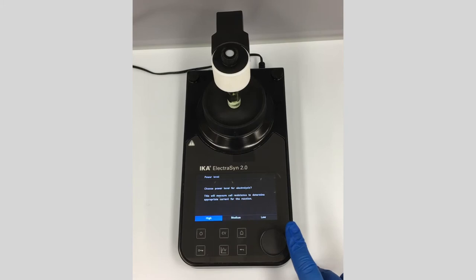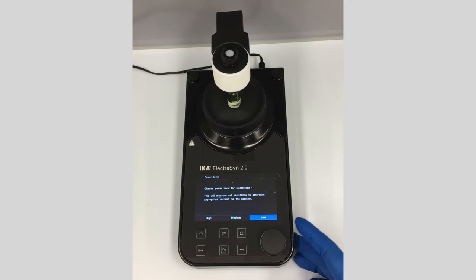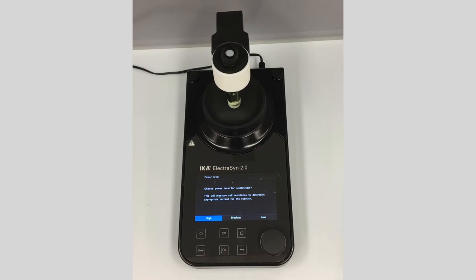After clicking OK, this is really the core of assist mode. The system offers different power levels that correspond to potentials: low is 2 volts, medium is 4 volts, and high is 6 volts. These are the terminal potential differences between cathode and anode. Selecting one determines what current is needed to run the reaction at that given potential.